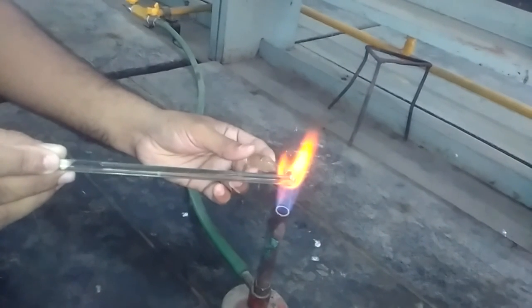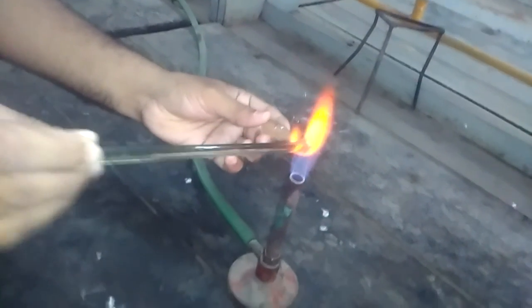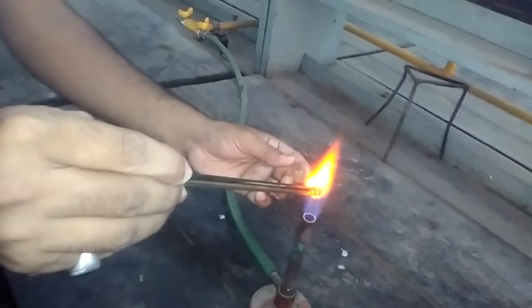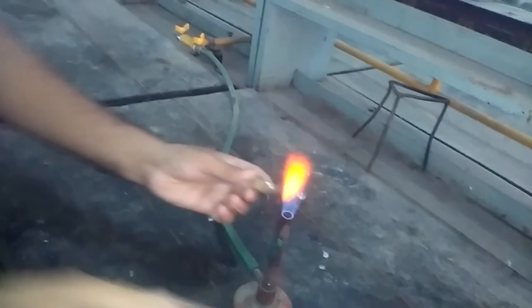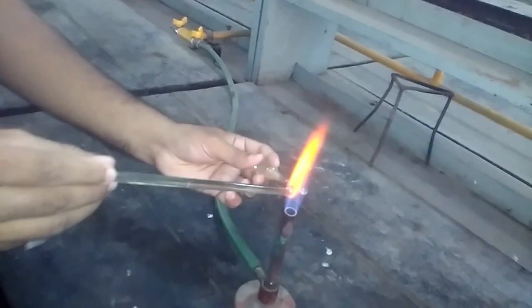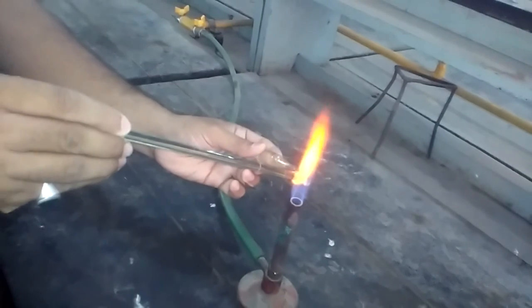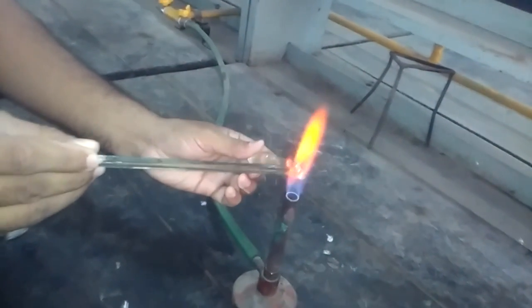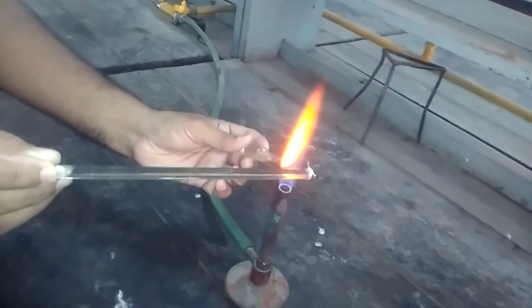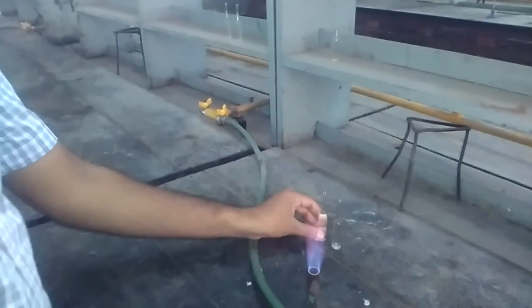So when this happens, gently touch the glass rod on the tip of the ampule and remove it like this way. Scratch the tip of the ampule with the glass rod.